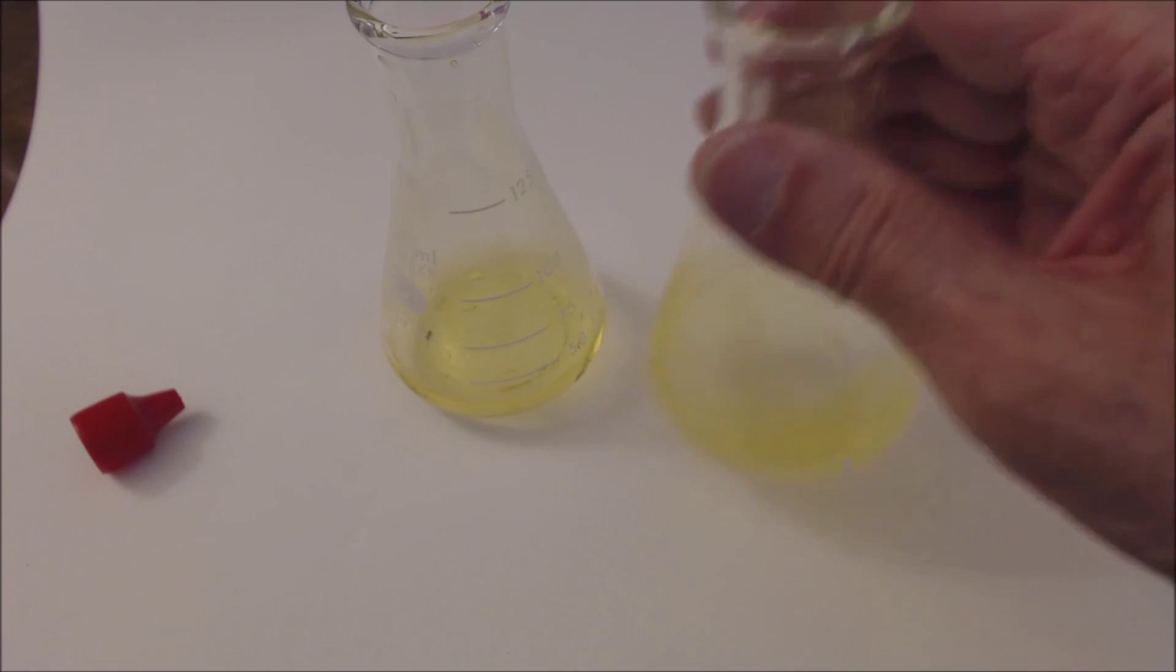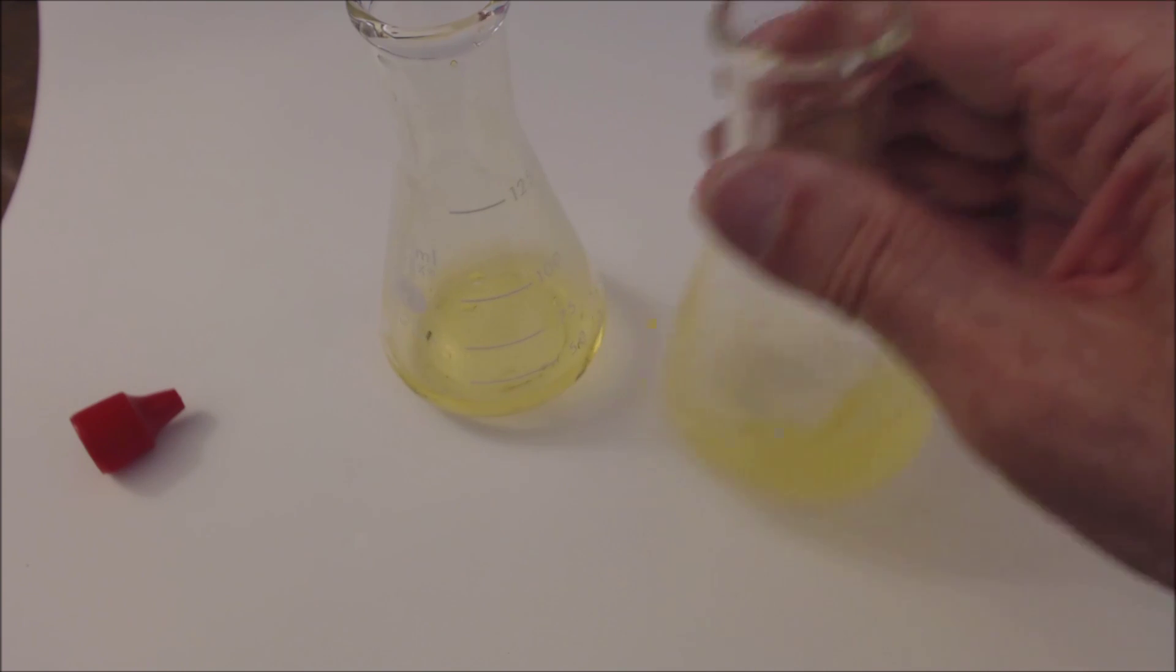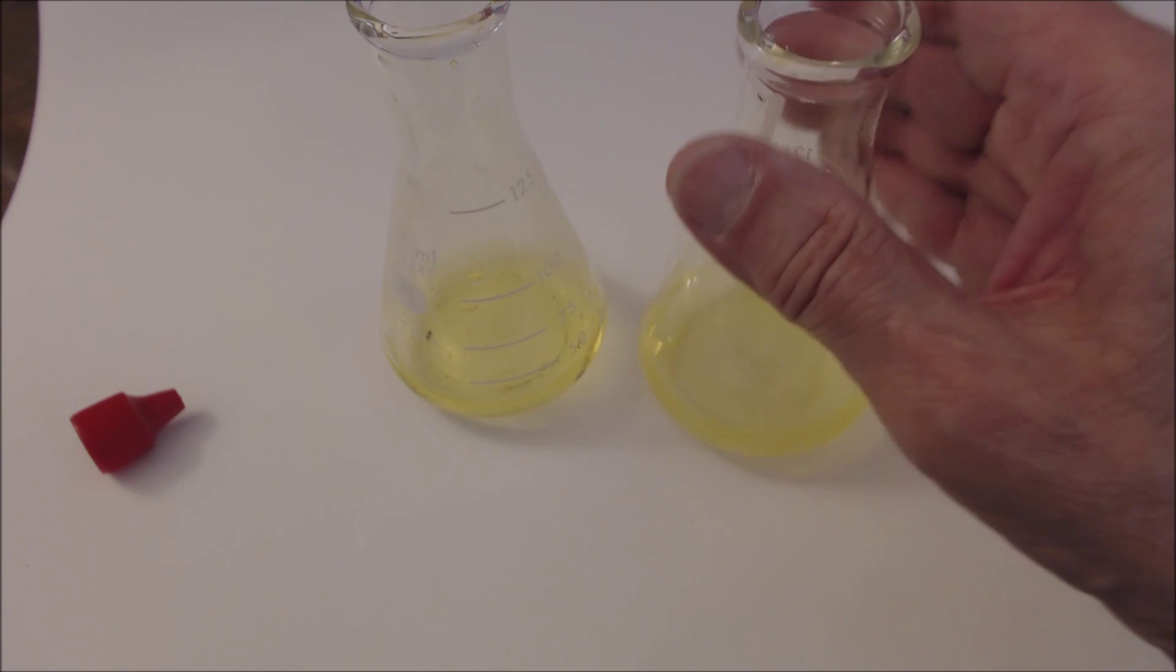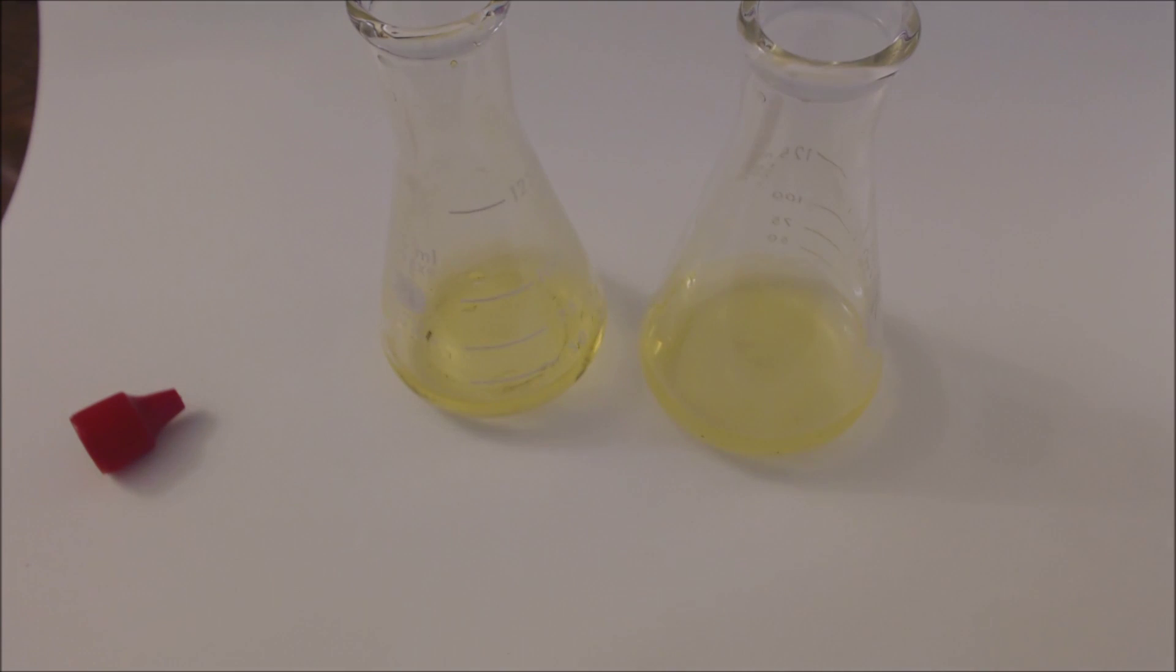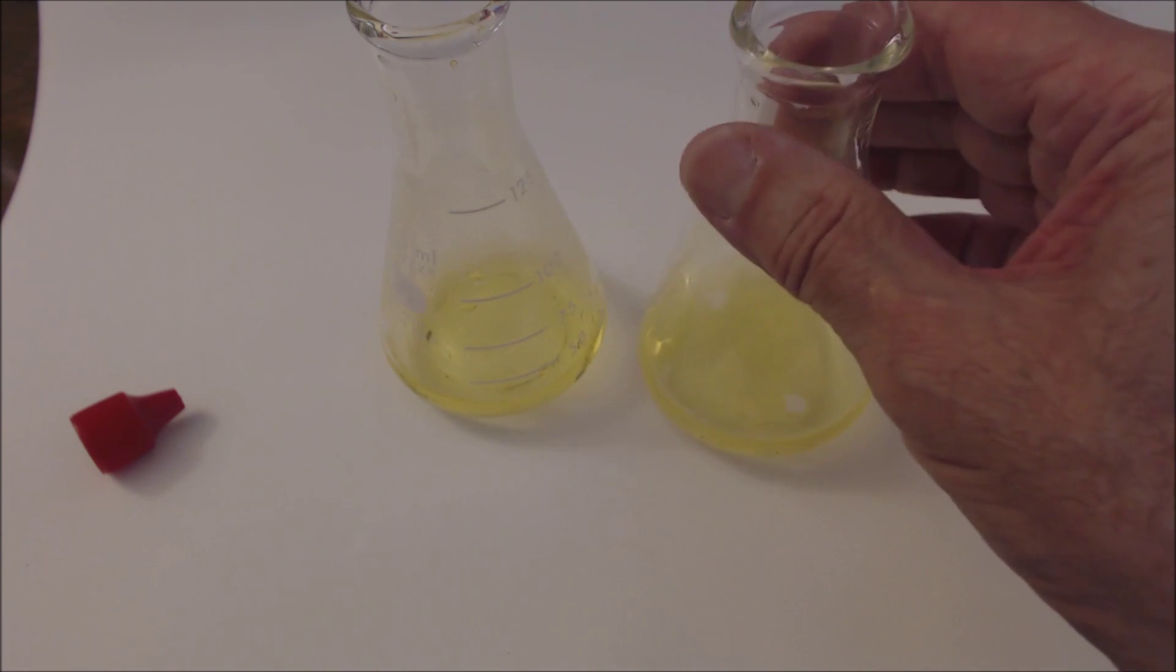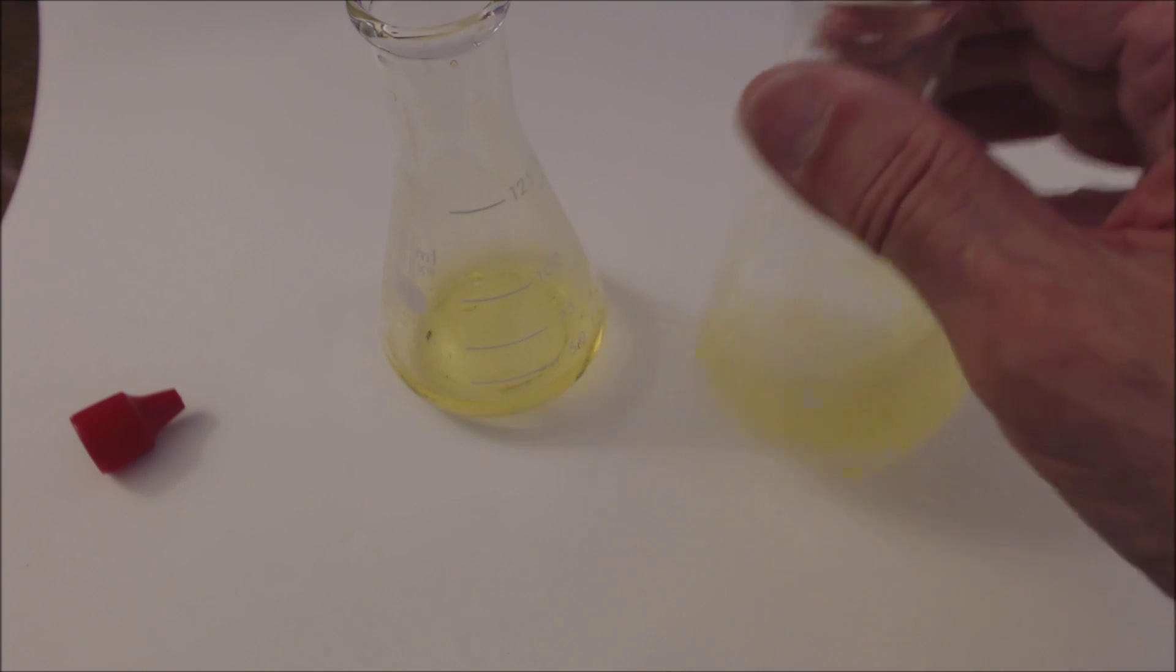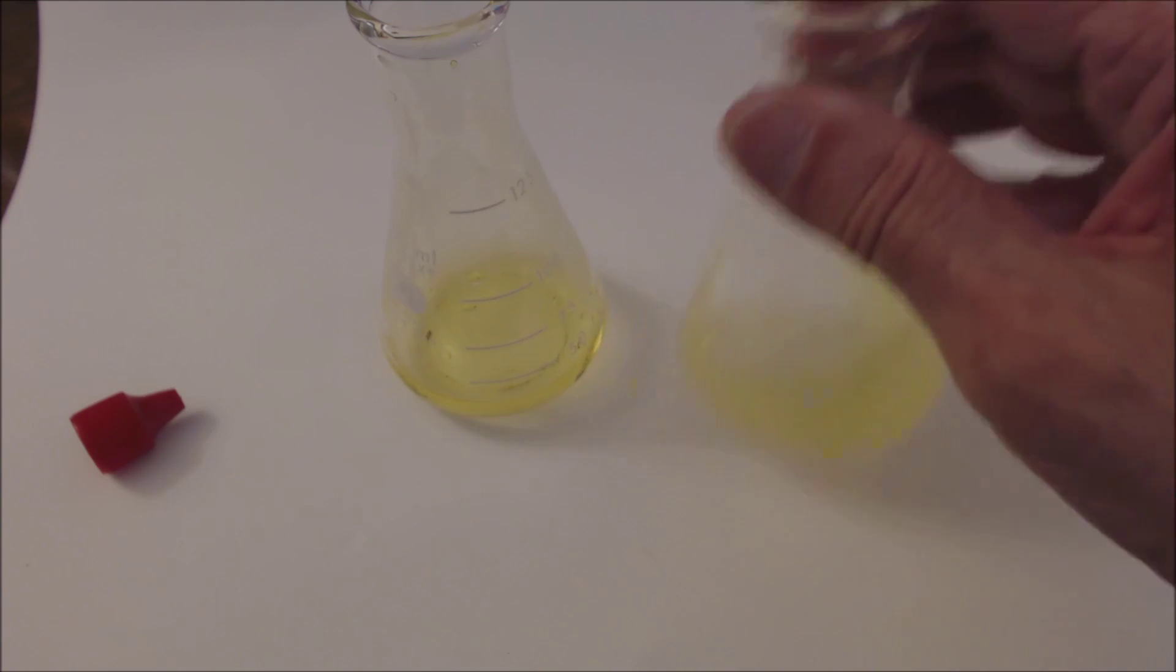If you're patient and swirl it, it clears up. It has a little turbidity. This is really a saturated solution of magnesium hydroxide. Very little of it dissolves in pure water. It forms like a suspension.